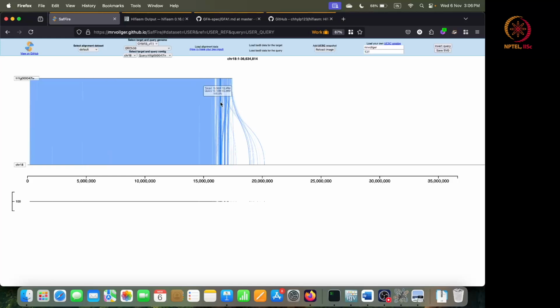You can see here that some regions on this contig align to a different location on CHM13, and this is actually an example of how contigs from a sample that is not the reference genome need not actually have arisen from the same location as the reference. So, this is one such contig. Let us look at another contig, right.